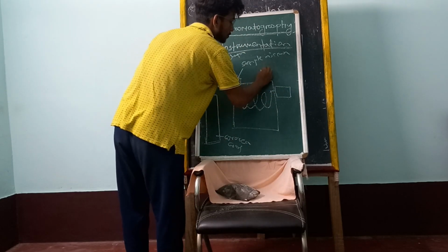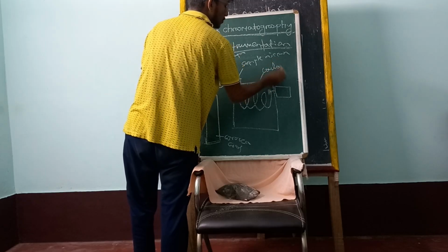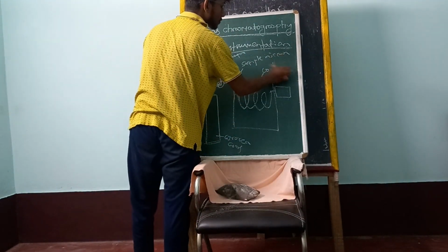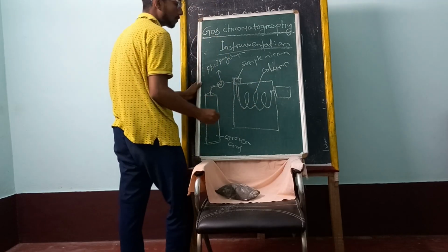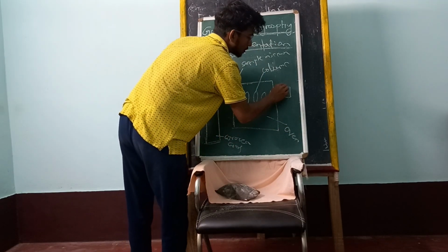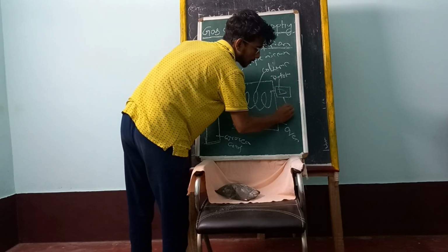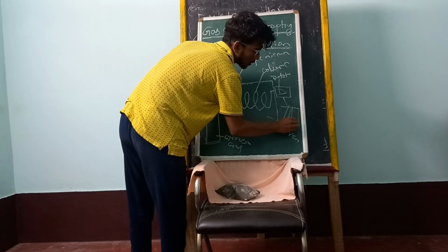And this is the column, this is the oven, this is the detector, and finally this is the recorder.